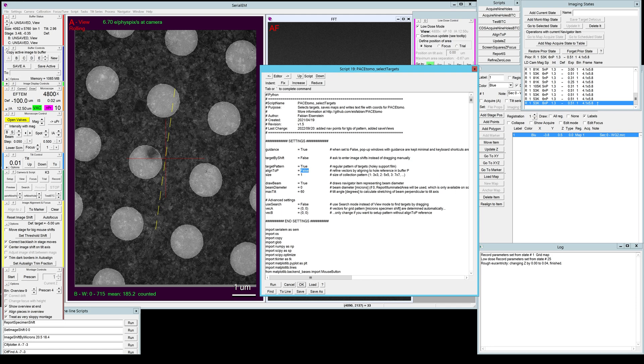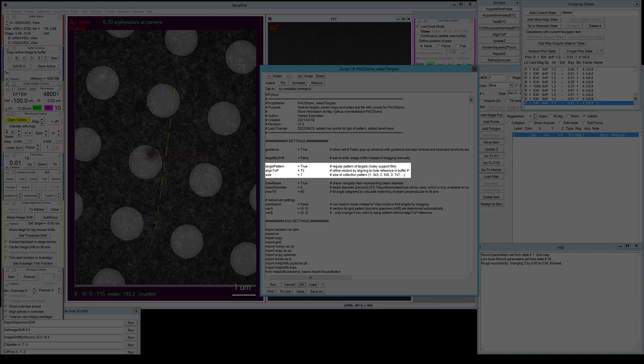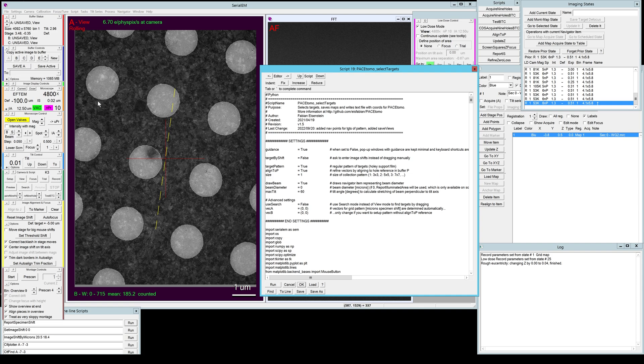That means we're gonna use a hole reference in a buffer in a SerialEM buffer P for the alignments of the pattern which makes it a lot easier.